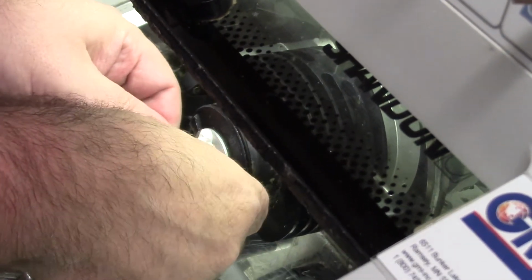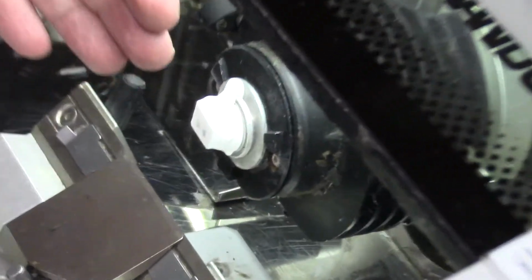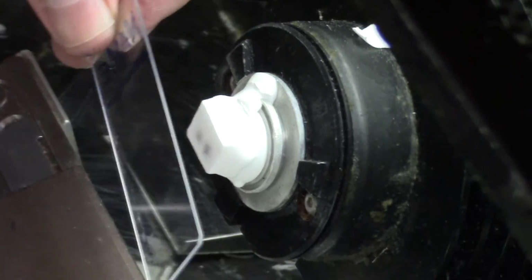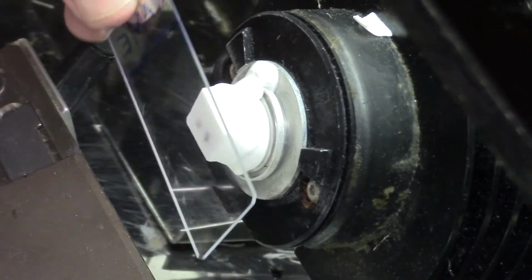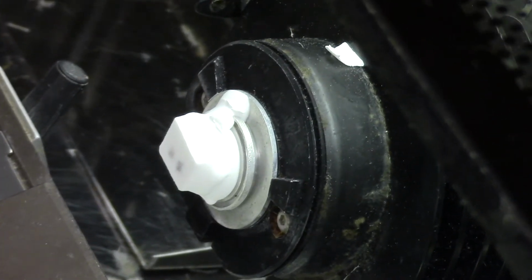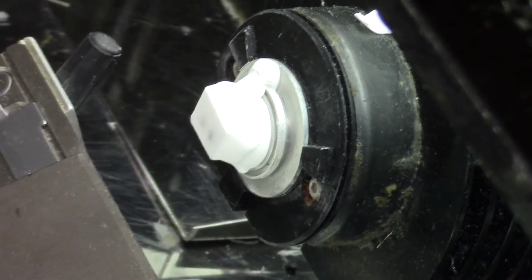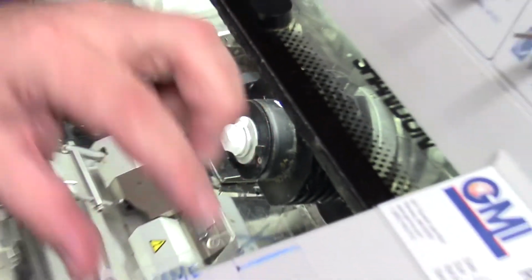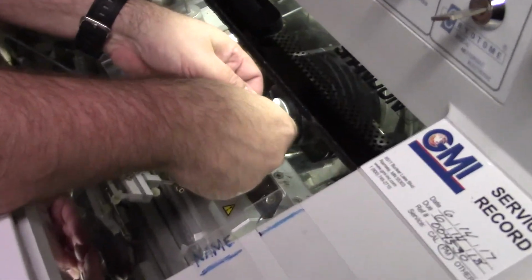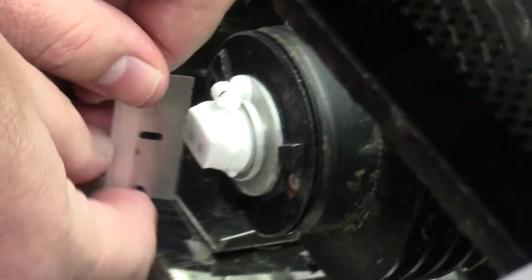Now as long as I've got a good solid sandwich there, I'm not going to knock the tissue off the block. So let's say I took my microscope slide and I put a piece of tissue on there. I could only fit like 3 of those pieces of tissue on the whole slide. You want to get a minimum of 10 tissue sections on every slide. Otherwise, you won't have a good number of samples to compare with antibody staining. So I'm not going to just cut the extra OCT off the top here. How about I also cut off the side?